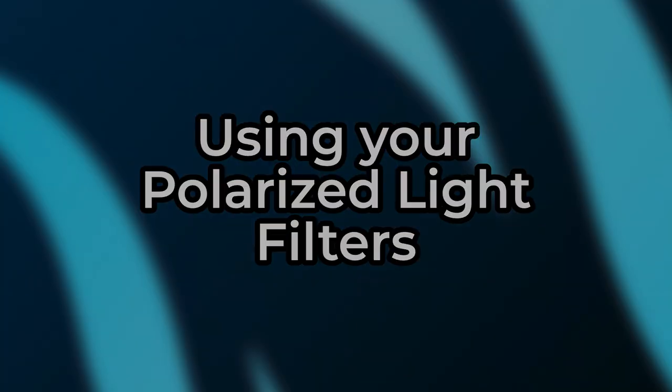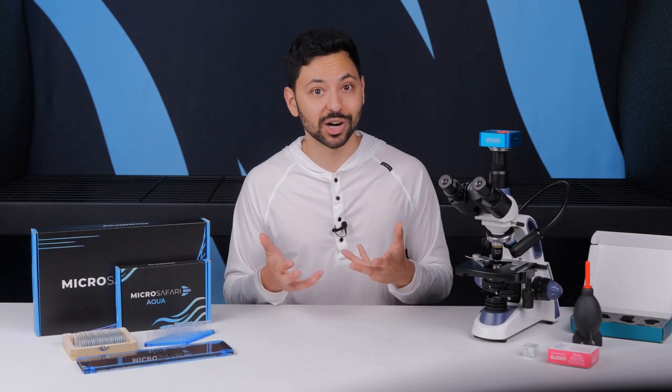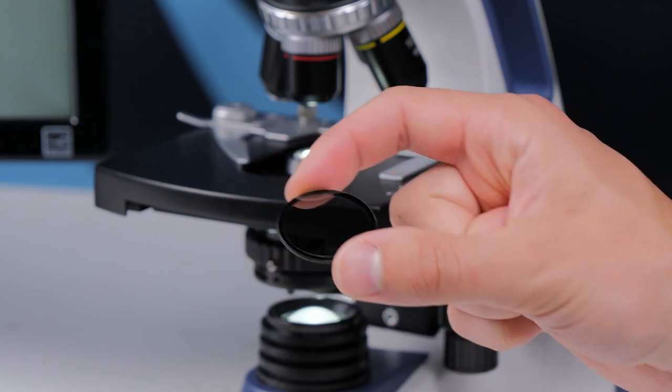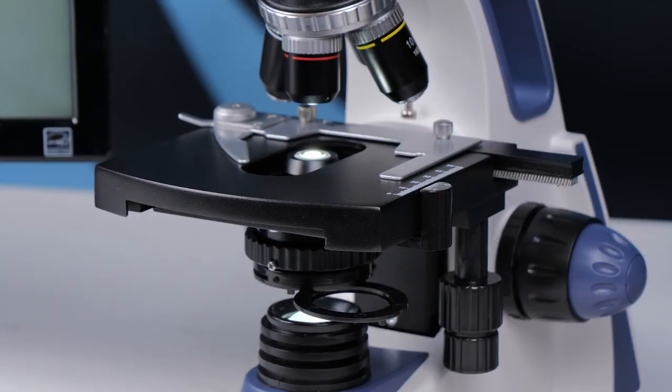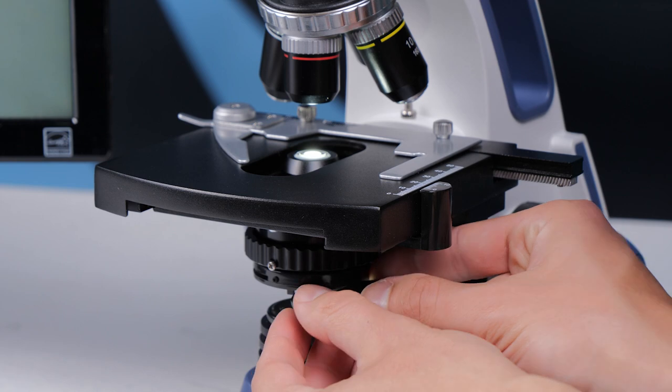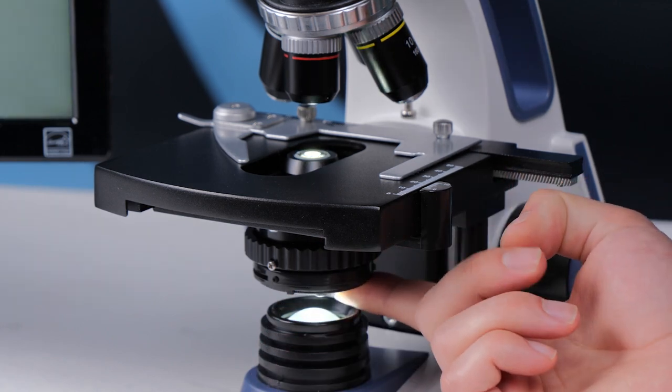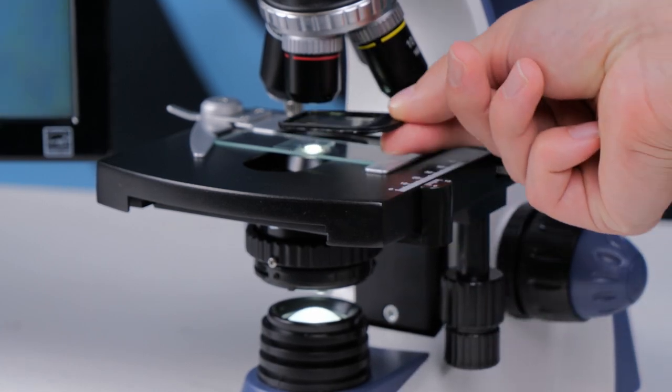Using the polarized light filters. There are a few ways to change your microscope into a polarized light microscope. If possible try not to touch the polarizing light filters with your bare hands since light directly goes through the filter. For transmitted light polarization insert the polarizing filter into the condenser filter holder. Now you have two options: you can either use the manual filter flag in between the top of the sample and the microscope objective, or for a hands-free solution you can unscrew the head of the microscope and place the filter into the hole and replace the microscope head.